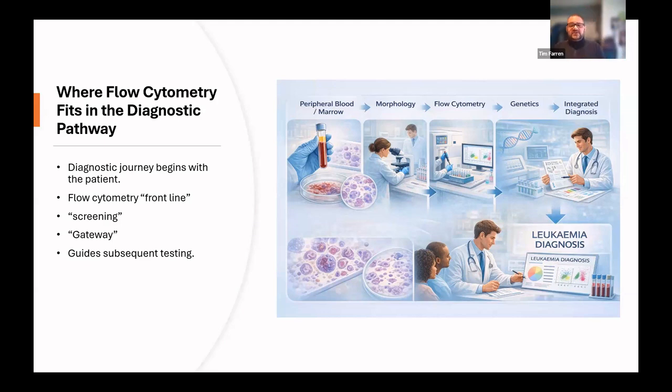So in many ways, flow cytometry acts as the bridge between the initial examination of the patient in the clinic, through the morphological assessment, and then deeper into the genetic characterization of the disease.